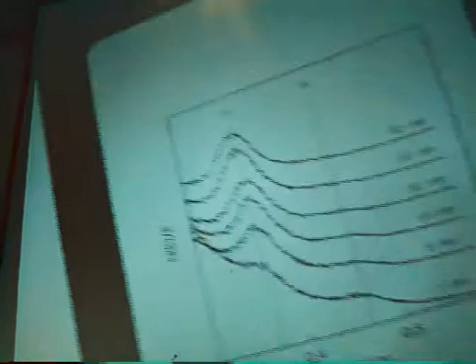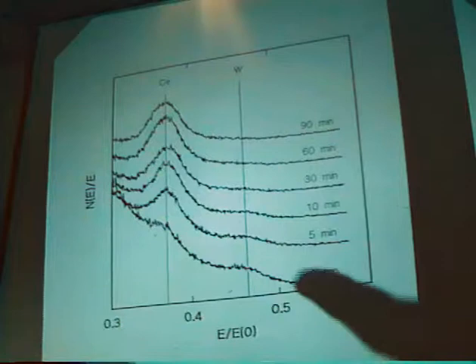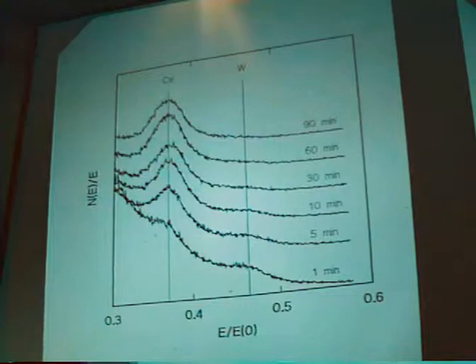The actual spectra here. Even here, the signal from the tungsten is much smaller than the one from the cerium. Yes, it is after you've etched it. But before the etching, they're not that much different. Then the cerium grows so much bigger. Yes, that's right, because you have this tungsten layer, and what you're etching off is the tungsten, and so you have this almost infinite supply of cerium oxide below that.